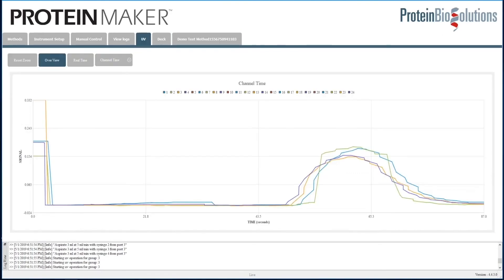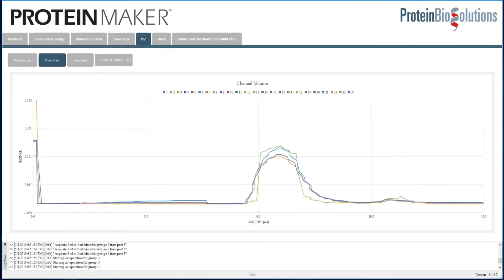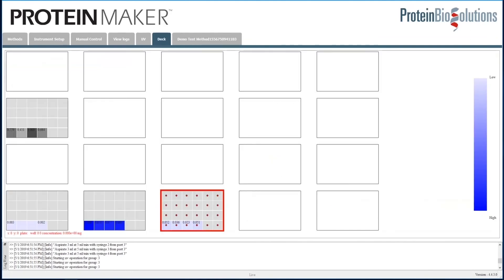If we go back to the UV tab, we can see the traces for the four channels. We can change the view on the UV tab to look at the trace in terms of time or volume. The method being nearly complete, if we had walked away and were just coming back to the system, we could see in the deck tab that indeed our protein did come out in the second plate.